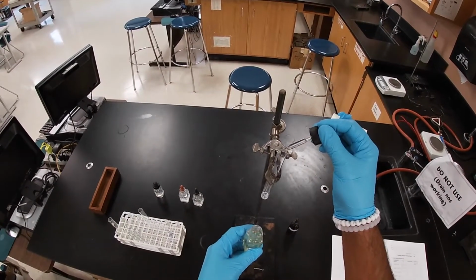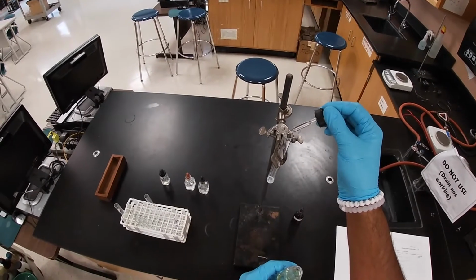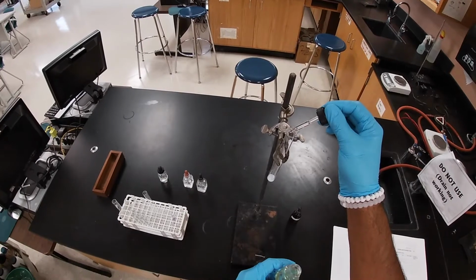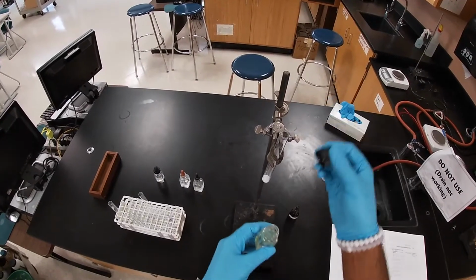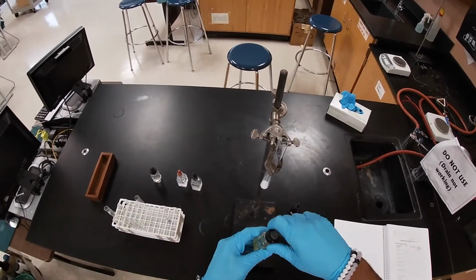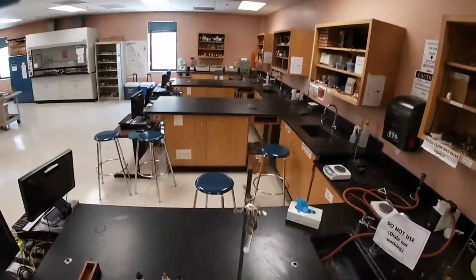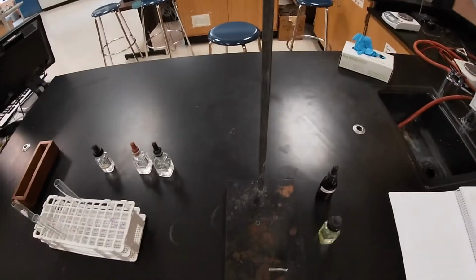So we're going to add a few drops. And as soon as I drop the first one, you notice some cloudiness happening in the solution. That should be enough. Let me go ahead and take the camera off from my head, so hopefully you can get a nice view.